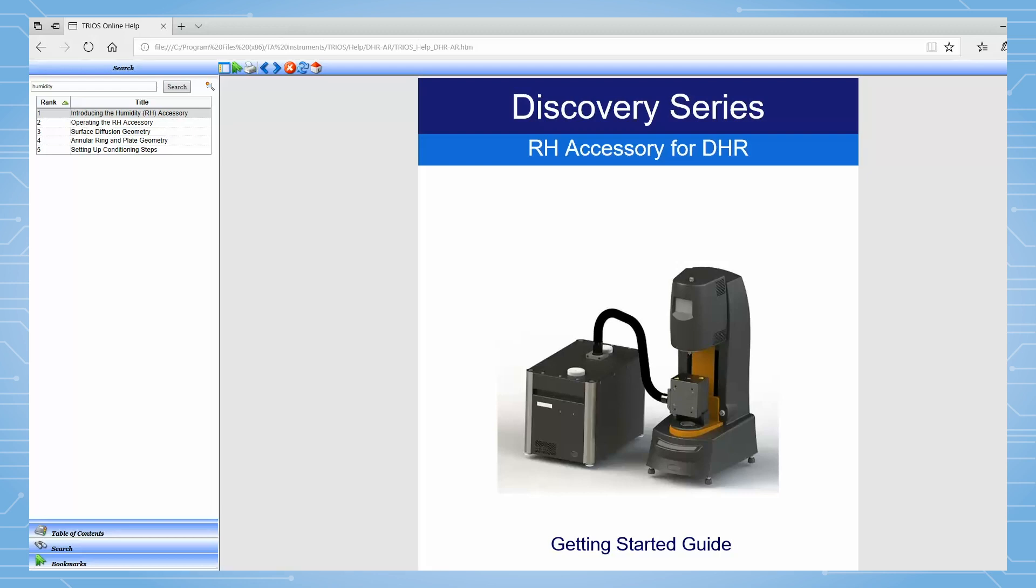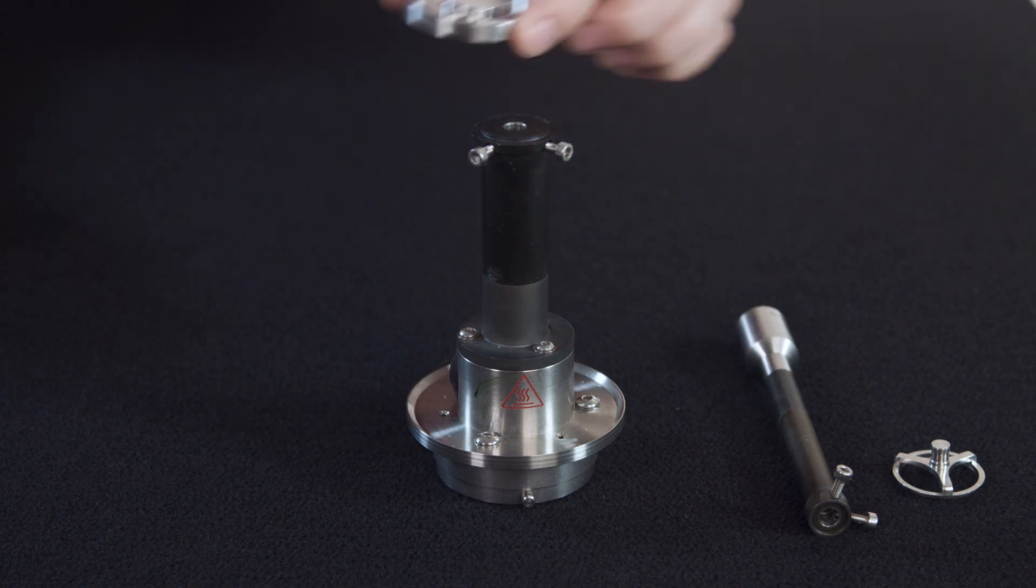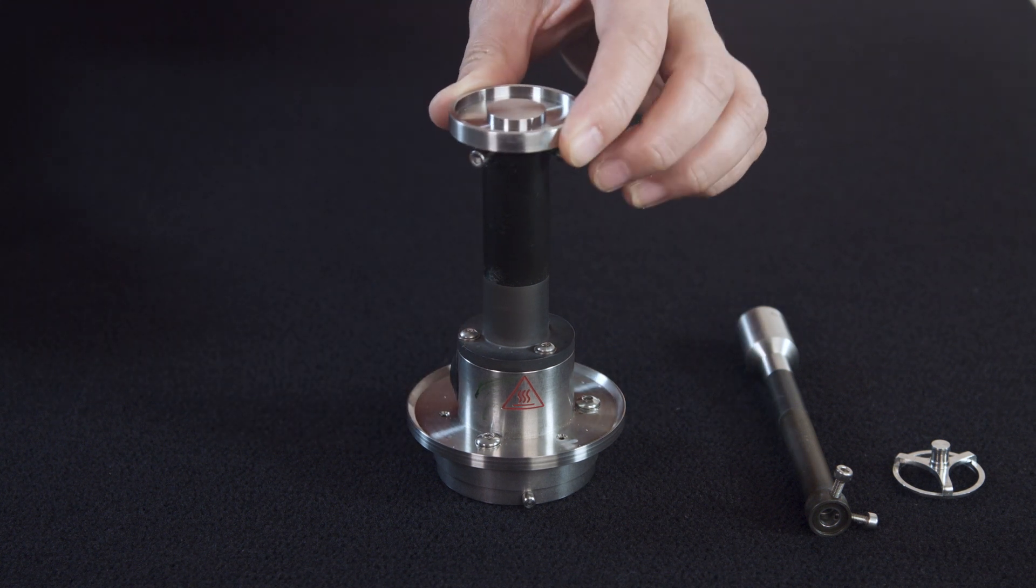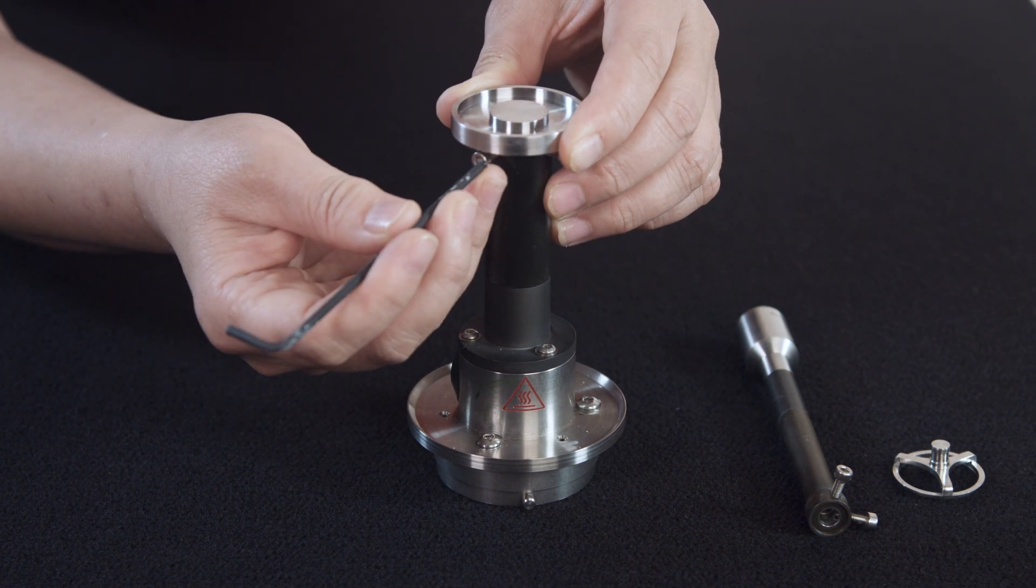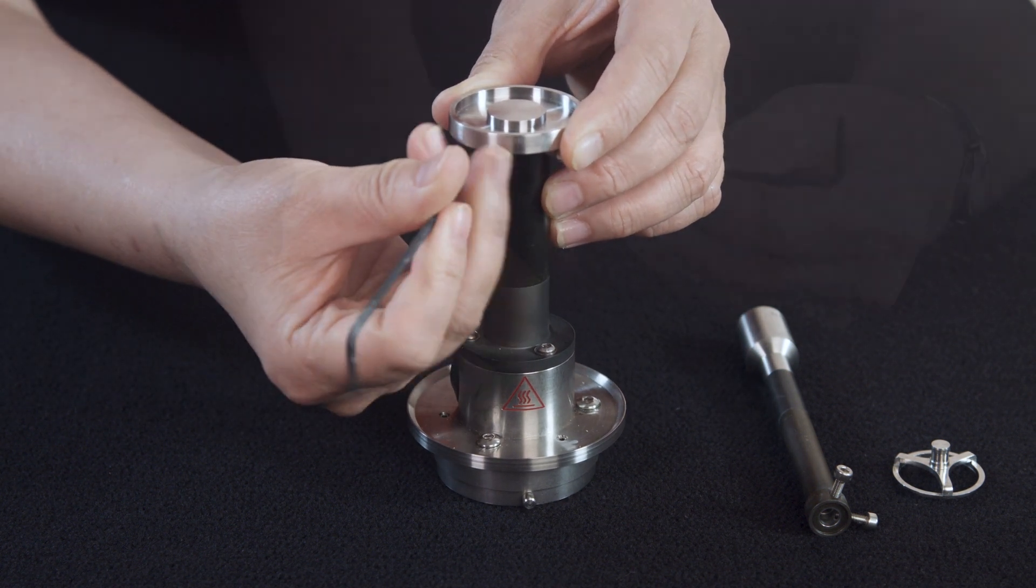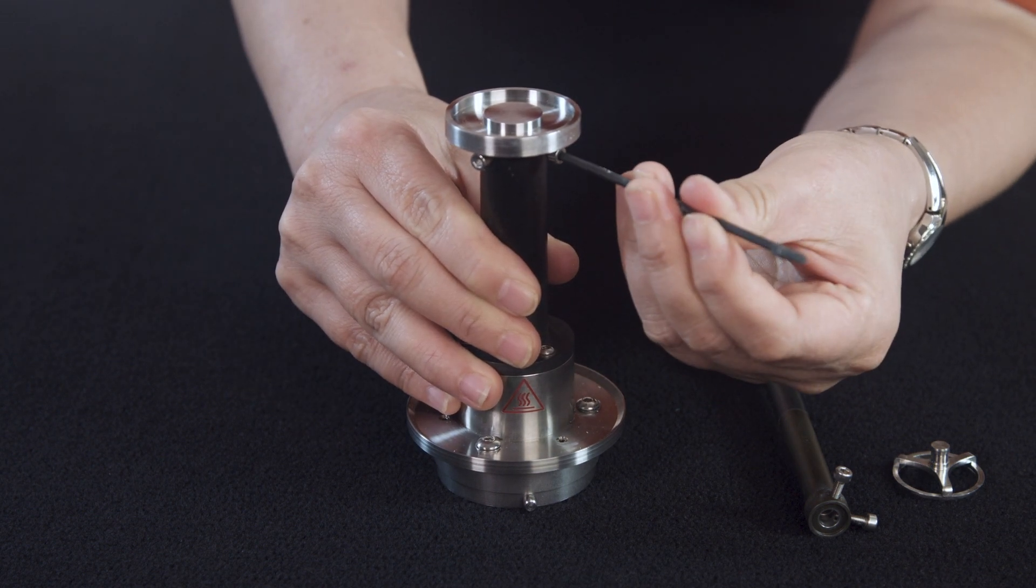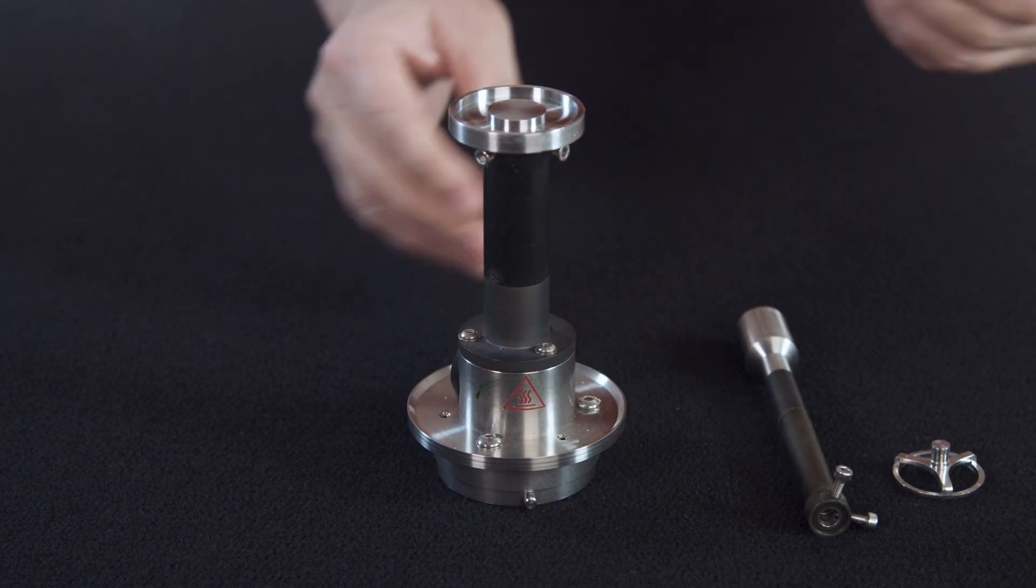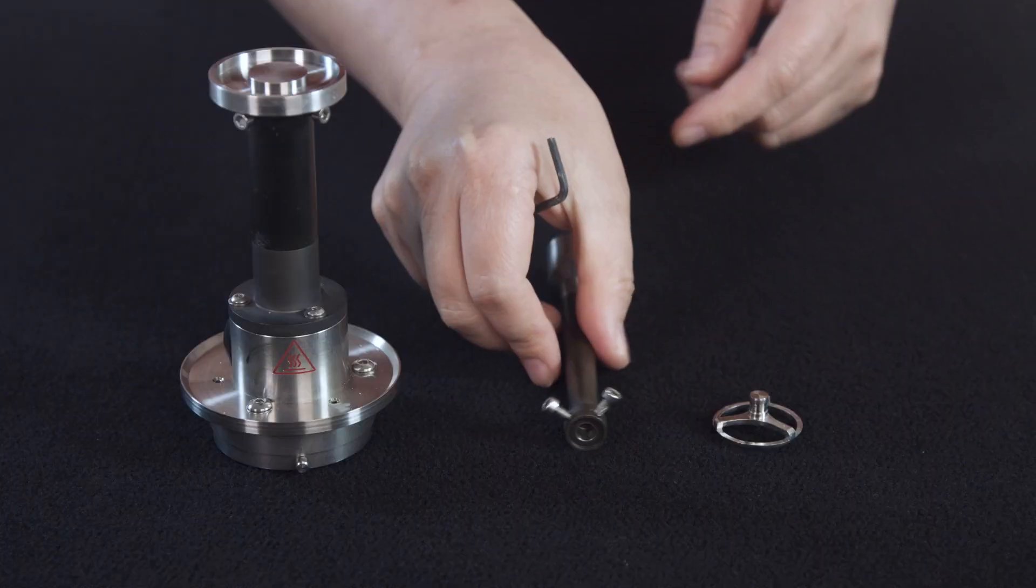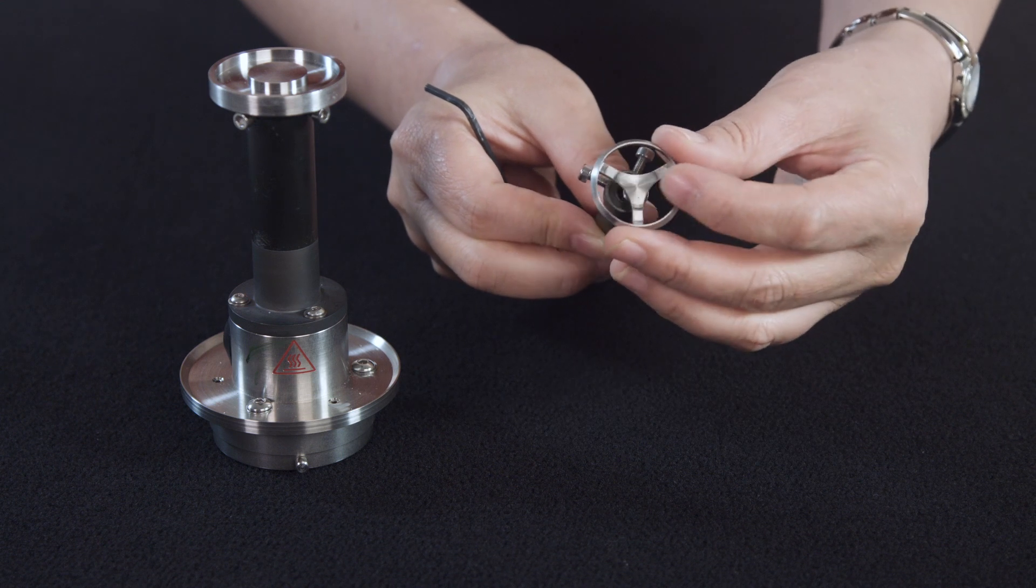To set up and use the surface diffusion geometry, first insert the trough to the bottom geometry stage. Tighten the screws using the Allen key. Then load the ring to the upper shaft.